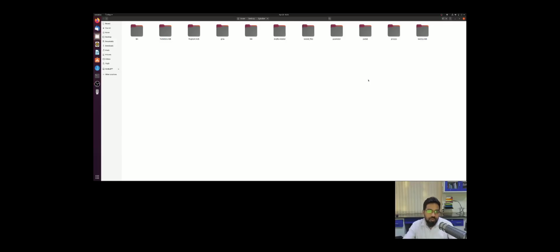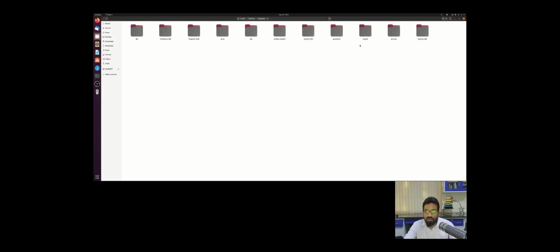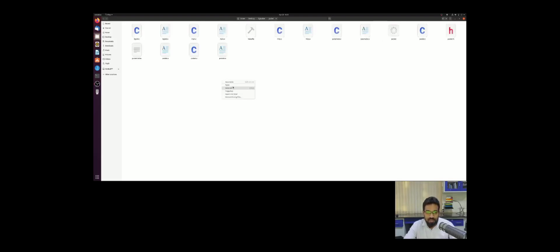There is no graphical user interface for running LigBuilder, so everything we are going to run with the help of the terminal. Let me first copy the protein in its PDB format and the co-crystallized ligand molecule in its mol2 file format. I am going to paste these two files inside the folder called pocket as the first step. The very first step is to run pocket.